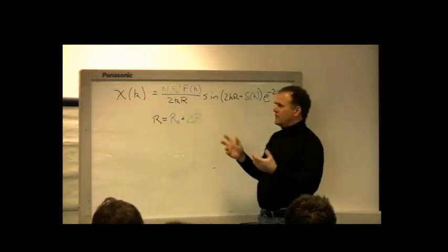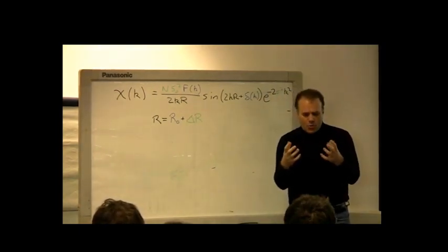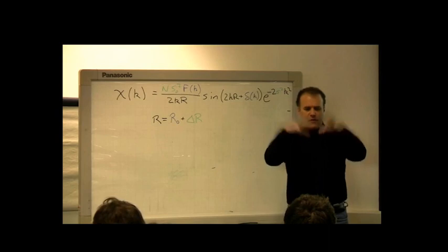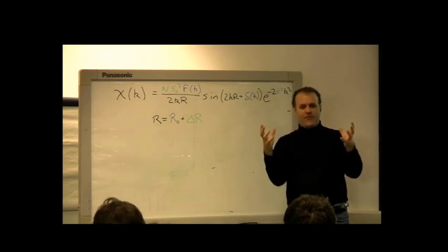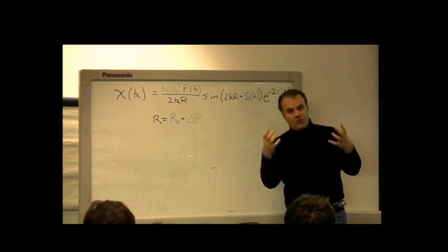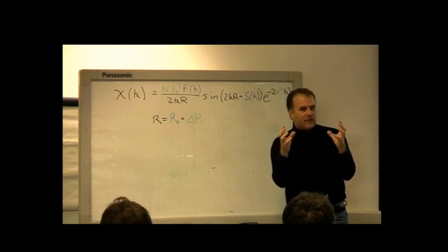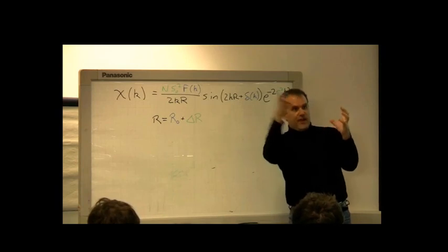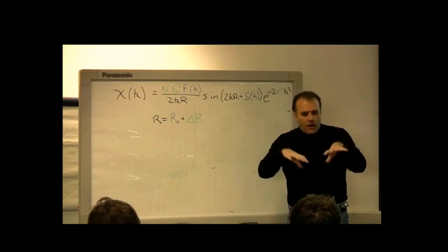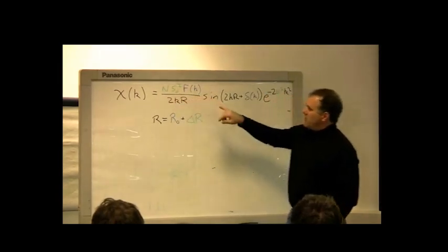There's a small effect in the data where the theory calculates its theory with all of the other electrons in the system in the state that they were before the photoelectron gets created. But in truth, when the photoelectron gets created, all of the other electrons relax a little bit because the screening has changed, because you've taken an electron out of the system. So there's a slight change to the electronic state of the entire system, which results in this term in the EXAFS equation being somewhat less than 1.